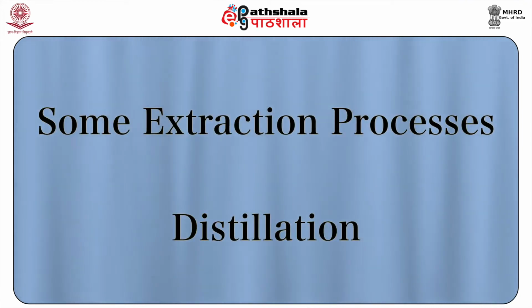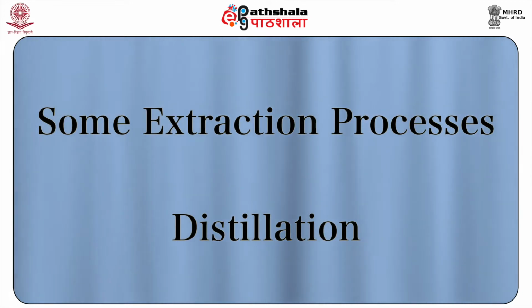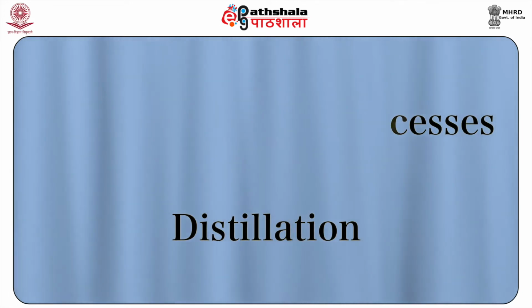Now let us study some of the extraction processes, under which we have first the distillation process. The method involves heating a sample of liquid to convert it into vapor, which is then allowed to flow into another location where it is cooled, condensing it back to a liquid form.